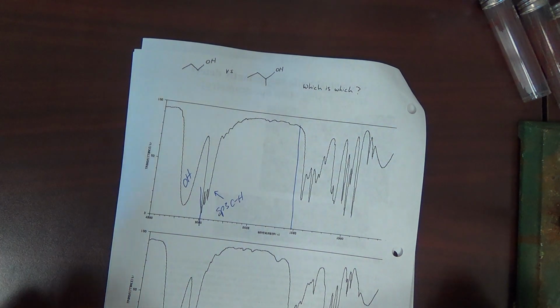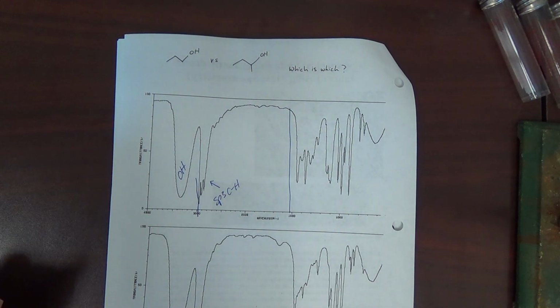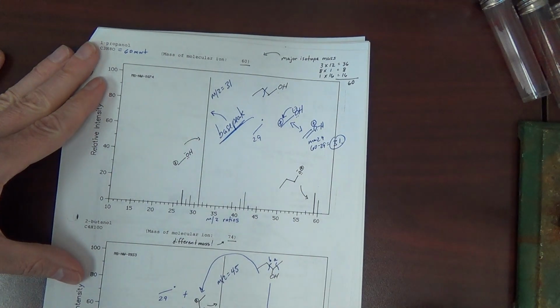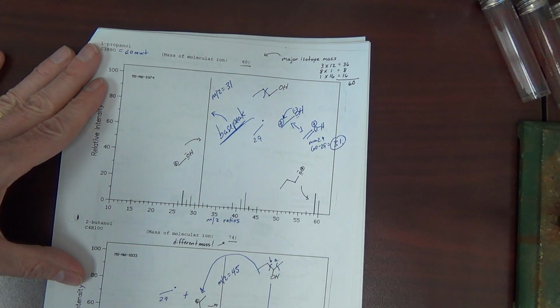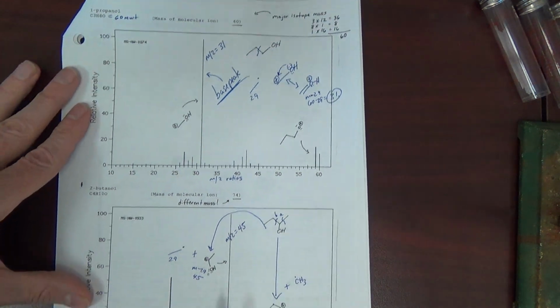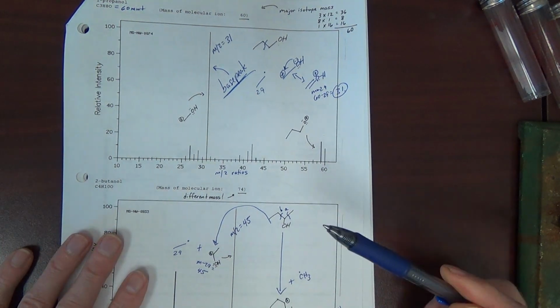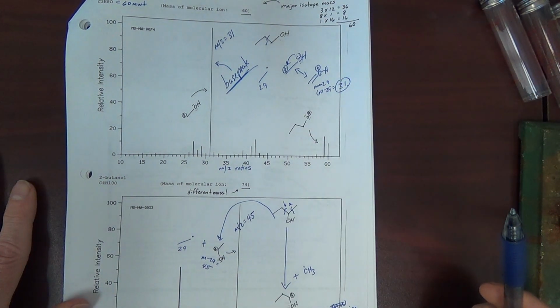IR has limitations. Most of your analytical techniques are complementary. IRs give you an idea of functional groups. Mass spec gives you an idea first of mass, but it also gives you an idea of how things are connected, the backbone. Because by knowing what we expect, we can see what cleavages occurred, and that really is telling us about how the backbone is put together. The fact that both of these are alcohols is really not a major part of mass spec.